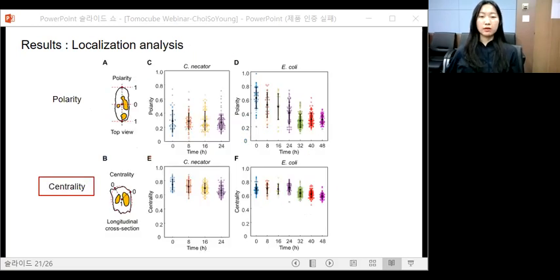Now go back to this slide. For the centrality, the two bacterial species show similar results. The average centrality values are 0.7 at the early stage, and the value changes to about 0.6 over time. These results indicate that PHA granule localization was biased toward the cell center rather than the cell membrane. Most PHA granules in both strains were localized in the middle between the cell center and membrane. It implies that the granule exists in a specific location within the cell rather than randomly existing in terms of centrality.